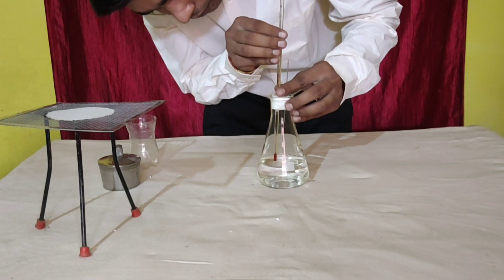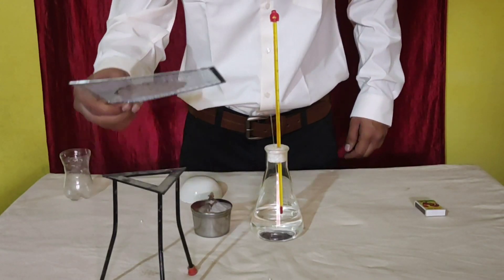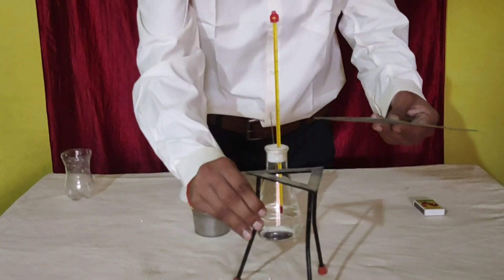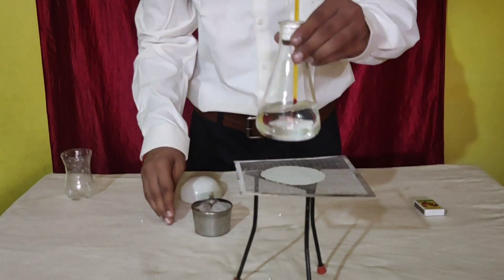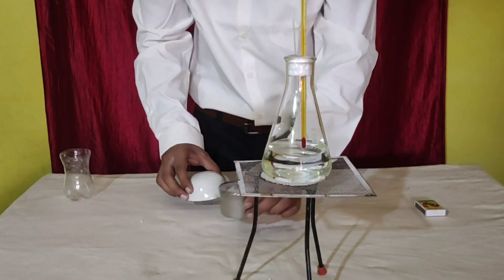The wire gauge is placed on a tripod stand, and the flask is kept over it. Now, water is heated with Spirit Lamp.